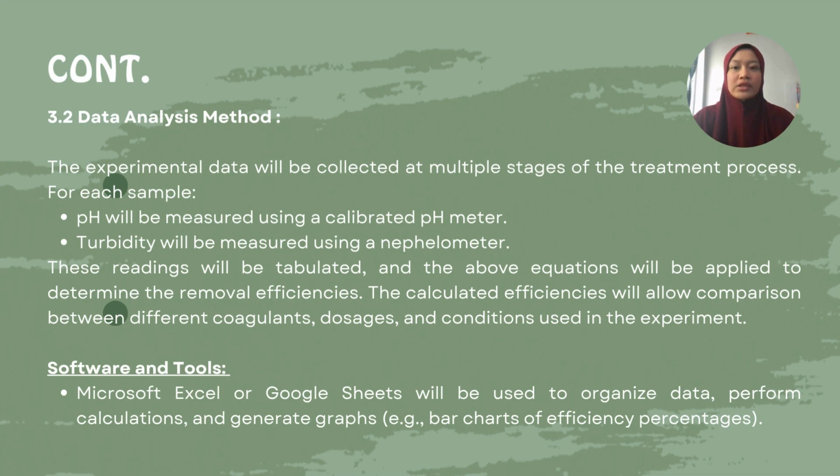And for the calculation, we need to use software and tools like Microsoft Excel or Google Sheets to organize data. So we perform calculation and generate graphs from Microsoft Excel.